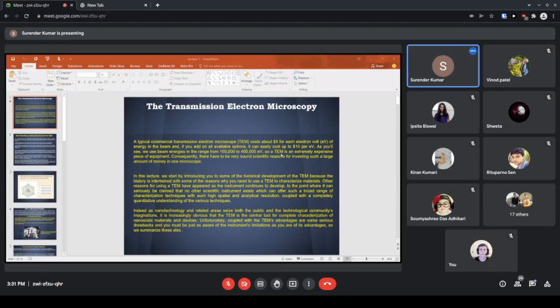If we calculate, for example, the denominator term mu sine beta, later we will see, we call this the numerical aperture, which is generally taken as unity, 1. The resolution is then basically half of the wavelength, so 0.61 lambda.